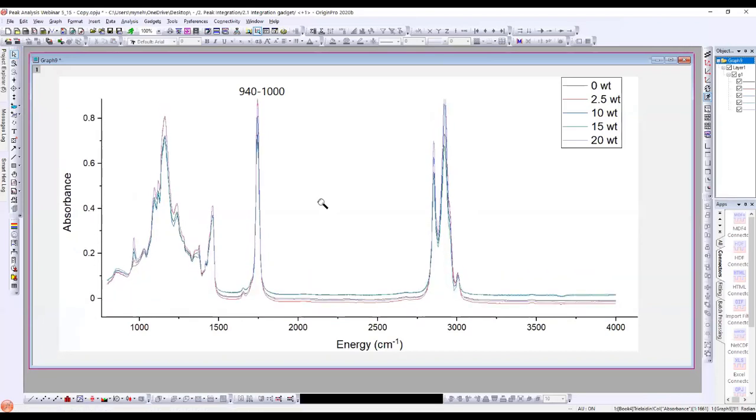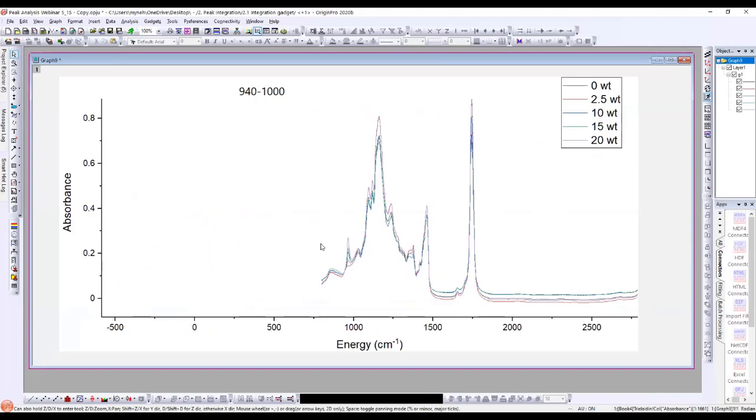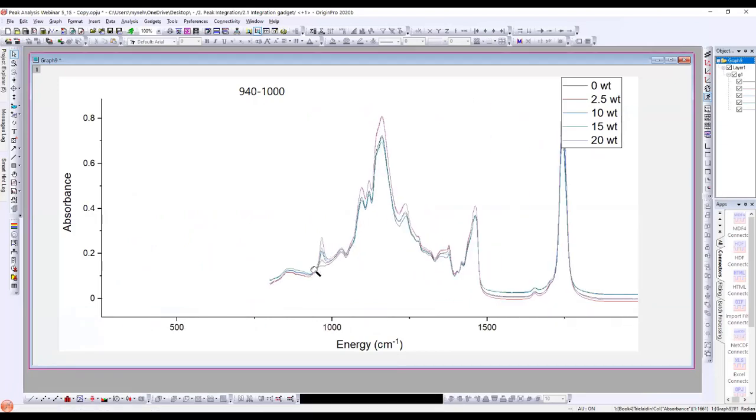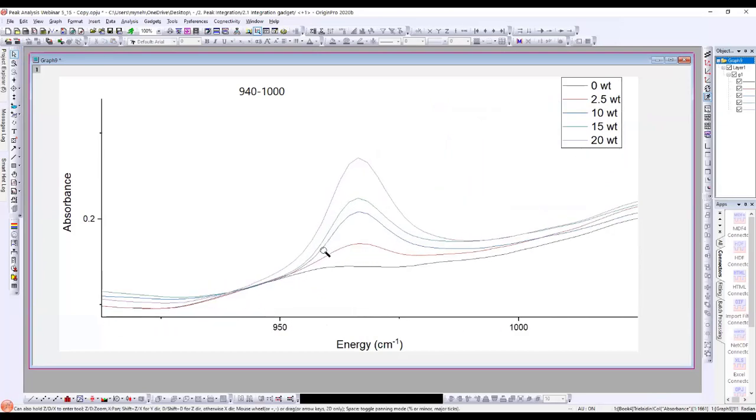Okay. So in this example, maybe a scientist wants to check one peak, and wants to know how the peak parameters differ between these five spectra, and for example, make a plot from it. Let's use these keyboard keys to zoom into one peak. For example, I want to locate just this peak. I move it to the middle, and then make it larger, and use the Shift key and the Z key to make it bigger. Okay, now it's good enough.